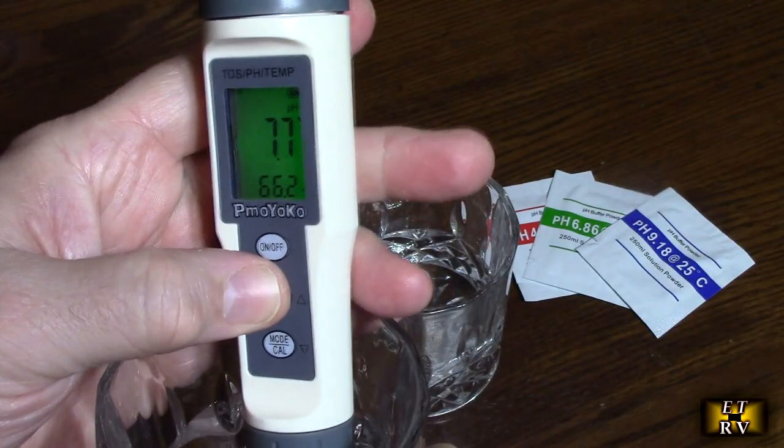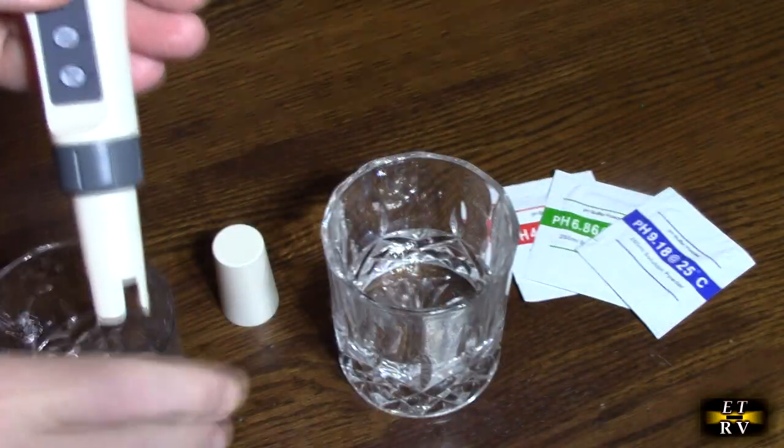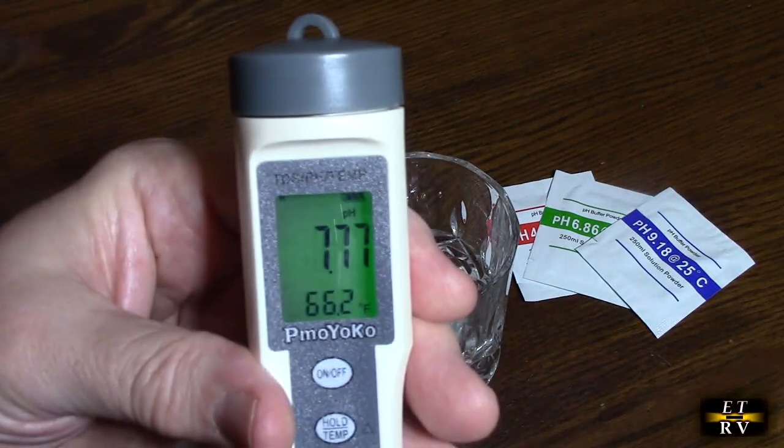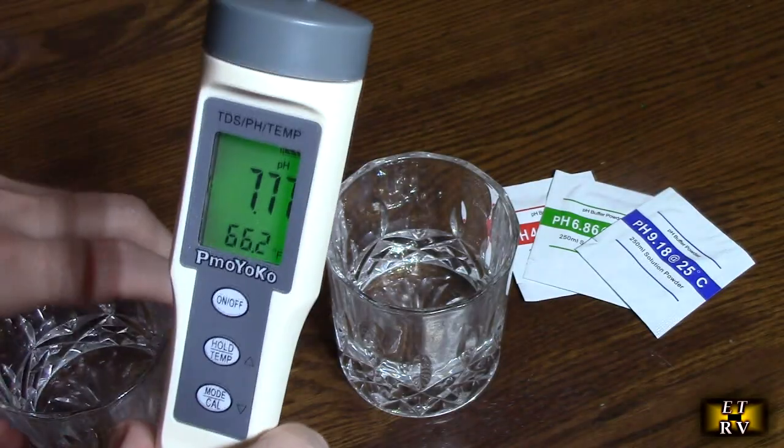If you want, you can lock it in just like that. Then you know what the pH value is locked in. Very handy to have.